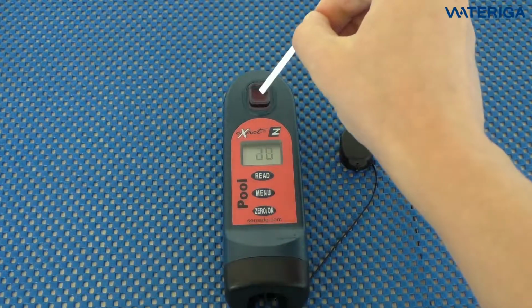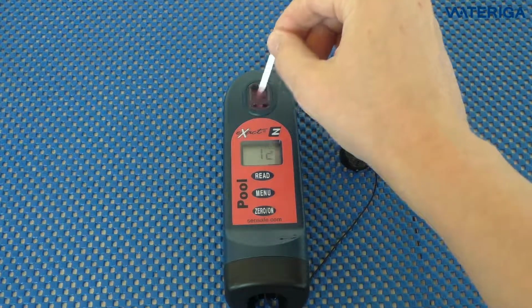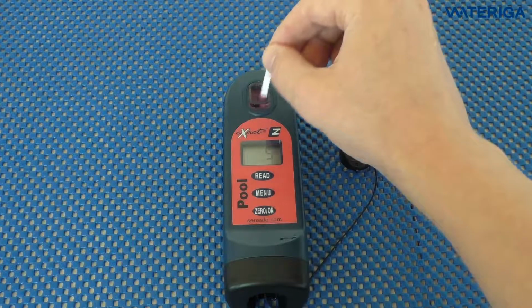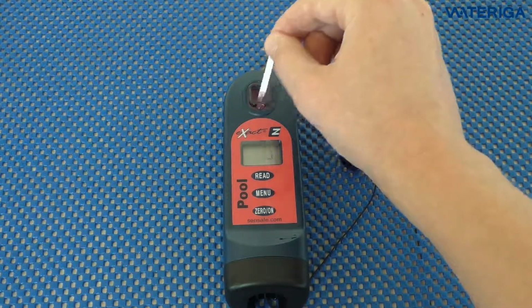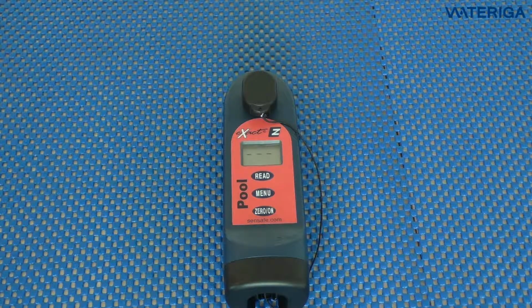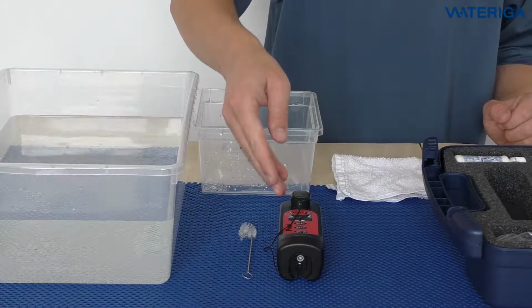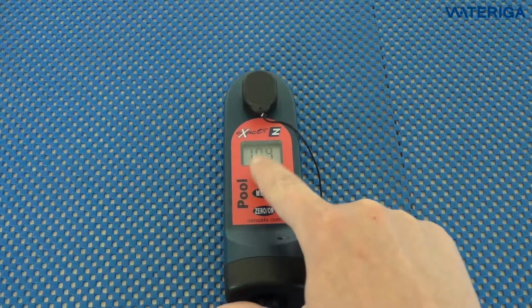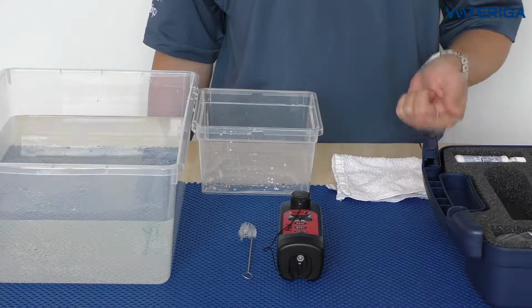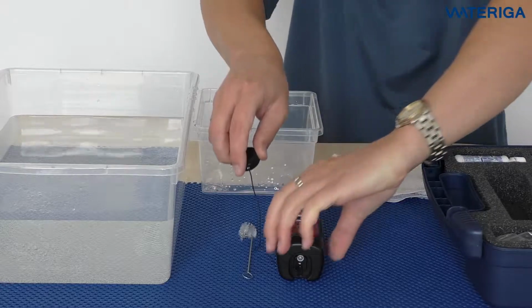Press read. It again gives you a 20-second countdown timer, and we just move the strip back and forth the same way as we did for free chlorine. By having the DPD3 separately, you can actually save money and not buy DPD4. Place the cap over again when reading. Now we will have combined chlorine calculated on the screen. If you would like to see total chlorine, you can press read again, and it will show you the total chlorine value straight away. So you get three results: free chlorine, combined chlorine, and total chlorine by only doing 2 steps. Now we're going to dump the water.